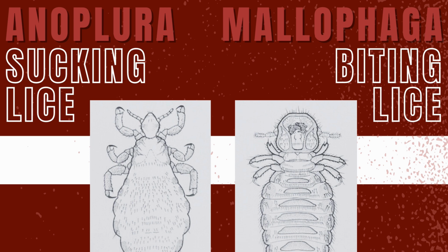On the other hand, as the name implies, blood-sucking lice have piercing mouthparts that allow them to feed on the blood of their host. In contrast to the heads of chewing lice, those of blood-sucking lice have a pointed appearance, and the heads are narrower than the thorax. When not in use, their mouthpart stylets are retracted within the head. The distinction between chewing lice and blood-sucking lice is important when choosing an effective therapy for treatment of pediculosis.